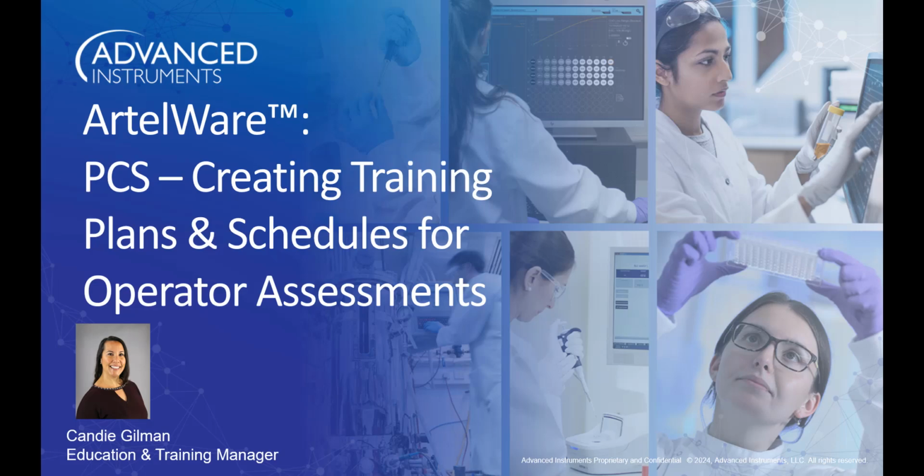Thank you for joining me for this tutorial that walks through creating training plans and schedules for operator assessments using the PCS system and the Artelware software application. I've got a little bit of information to share with you, so let's go ahead and get started.